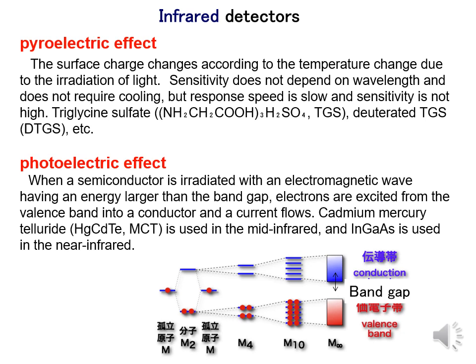However, since light is once converted into heat, the response speed is slow and the sensitivity is not very high.